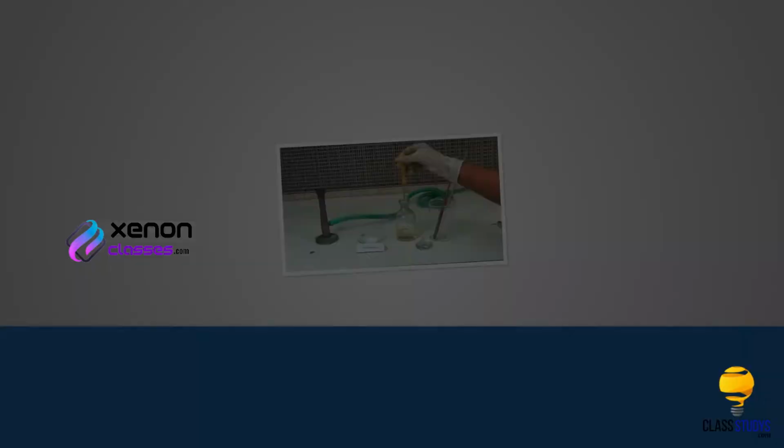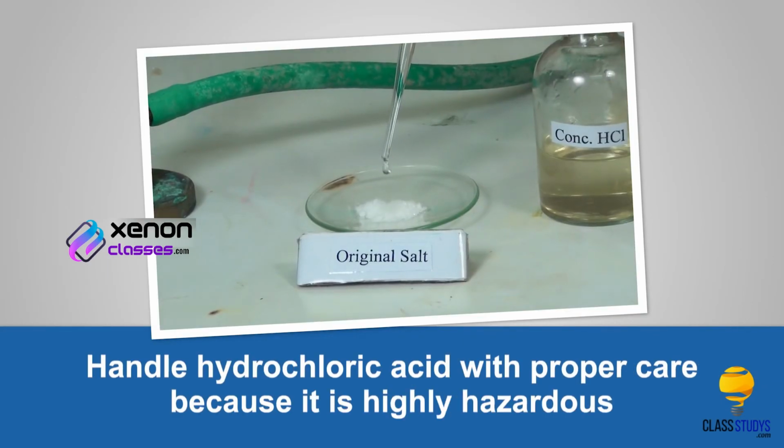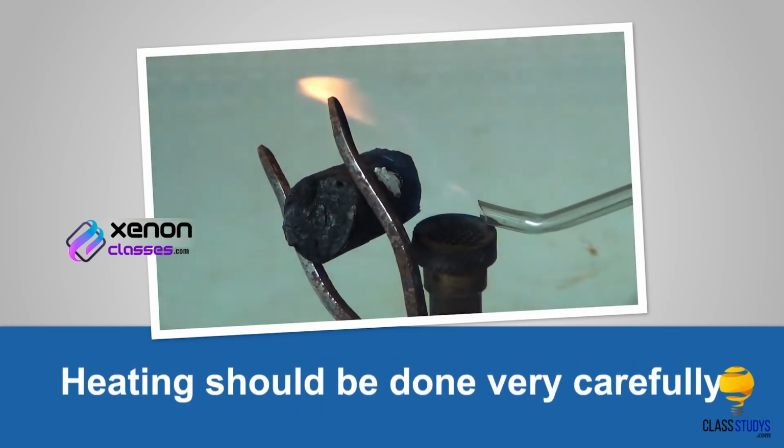Precautions. Handle hydrochloric acid with proper care because it is highly hazardous. Heating should be done very carefully.